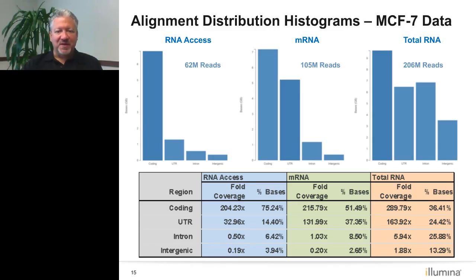And I think this is something that you need to be cognizant of when you're thinking about doing a transcriptome experiment. What type of sample do you have? What types of things would you like to capture? What types of things are you interested in looking at in the data? Because you get significantly different views of the transcriptome. These are all perfectly legitimate. They're all perfectly correct, if you will. It's not like one is more biased than the other. They're just different slices of the same pie.